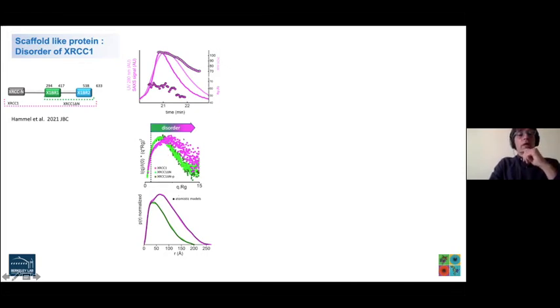But when the peak of the Kratky plot is shifted from this line, which is the square root of 3, and I don't want to go into detail why. I think Rob is going to be spending hours on it, why this square root of 3. But basically, by looking at the peak position relative to this line, I can tell you how disordered you are. And indeed, this is an extremely disordered protein. Not only is it shifted, but it's not a bell-like shape.